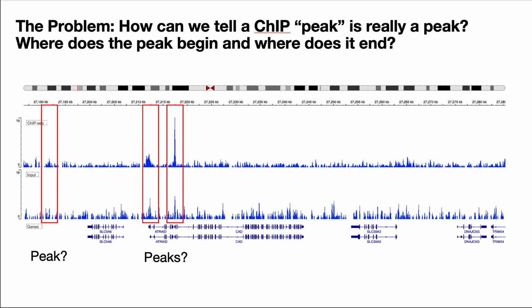To answer these questions, we need a statistical approach which can rigorously test all these regions throughout the genome. This test should ideally separate real peaks from the background noise that might just resemble a peak by random chance or because of some unforeseen source of bias.